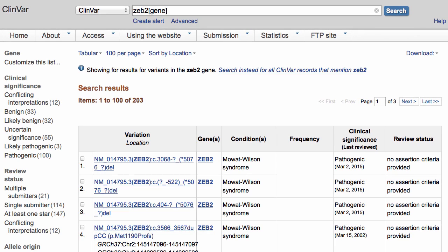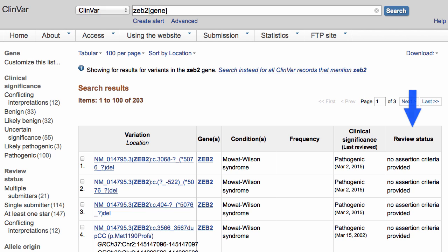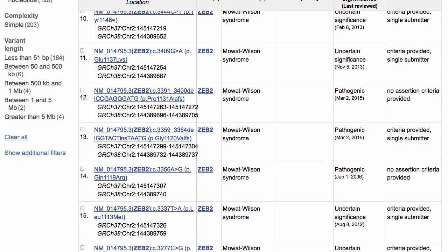The results are presented in a table with the name of the variant, the gene it's in, the conditions for which the variants have been interpreted, allele frequency if available, the overall clinical significance, and the review status. This search has more than 200 results, but you can narrow them by using the filters on the left. For example, you may only be interested in variants that have been reported as pathogenic, or you may want large-scale structural variants.